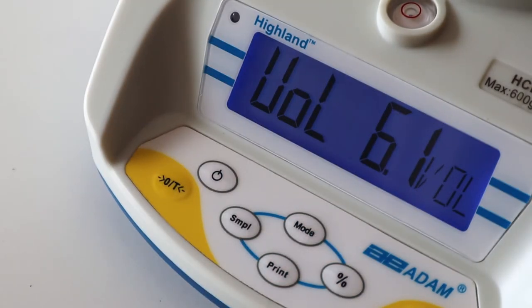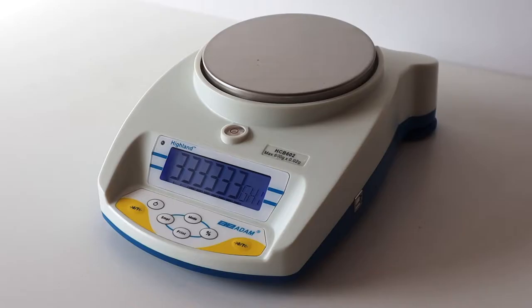To switch the Highland on, press the power button, and when you see zeros on the screen, you're ready to begin weighing.